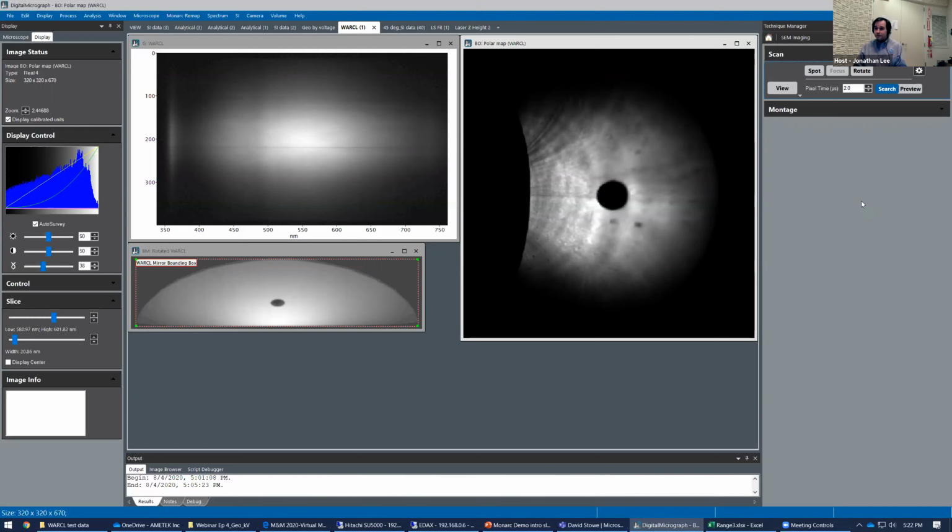The gratings have efficiency that's dictated by their shape. So if you try to go to a very long wavelength with a grating that's been tuned for ultraviolet, you're not going to get any efficiency there either. So it's really a concert of all these different pieces that are contributing to the ultimate spectral capacity. But I've seen as far down as, I want to say, 280. It's challenging to find specimen that go much further down than that.